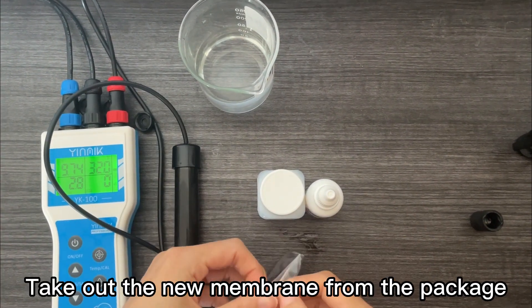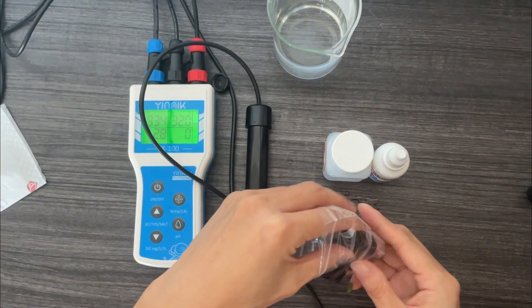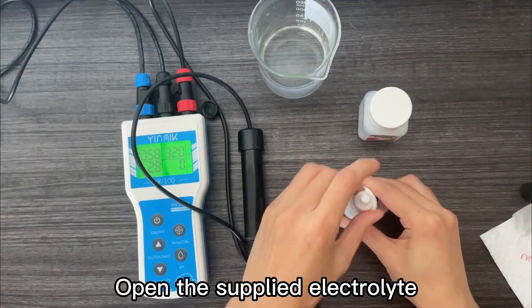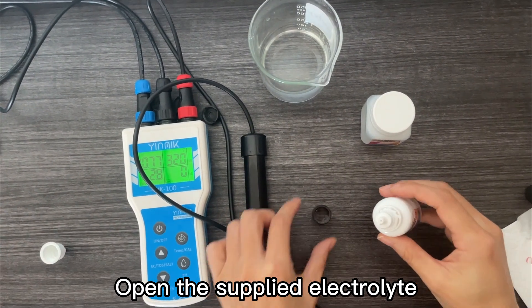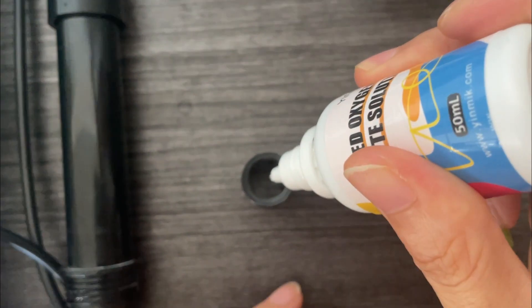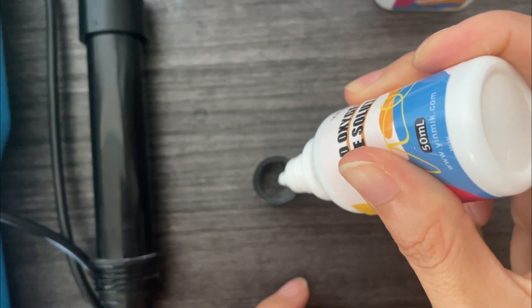Take out the new membrane from the package. Open the supplied electrolyte. Pour the electrolyte into the membrane. Add three-quarters or full of electrolyte.